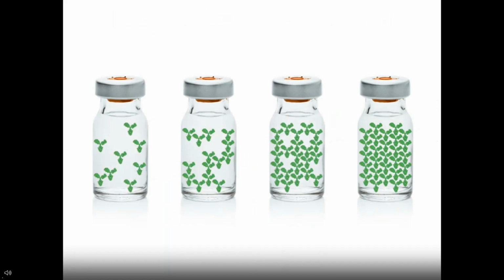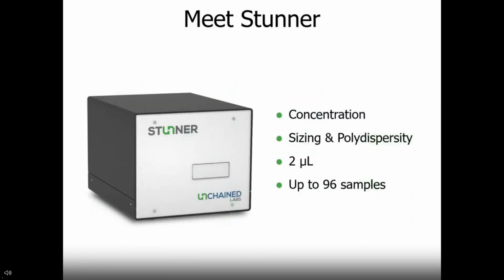If we want to take a look at another case study on Honeybun, we can have, say, this therapeutic antibody where we want to target which concentration we want to use for our injectable formulation. So if we go to really, really high concentrations, in other words, what's going to be ideal for what we can actually inject? Well, the first part of that problem is understanding the concentration that our antibody solution is at.